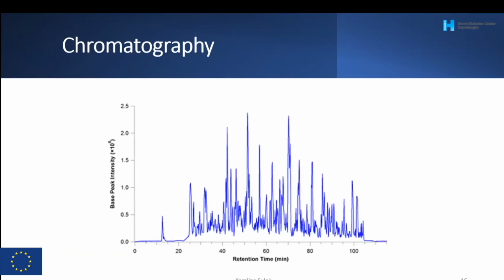For those who never saw a chromatogram, this is how it looks. We have the intensity of a peak and we have a retention time. If you look inside the data, there will be a mass. As Andresa said, it's a 3D type of data for normal MS.